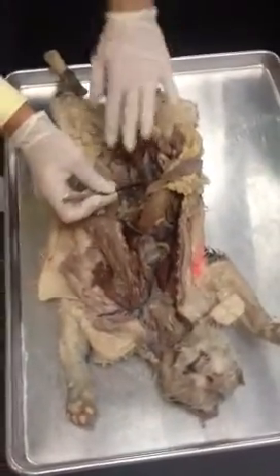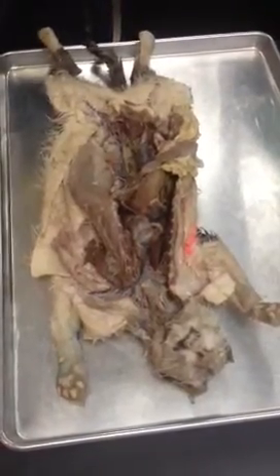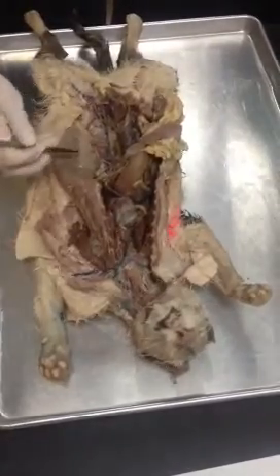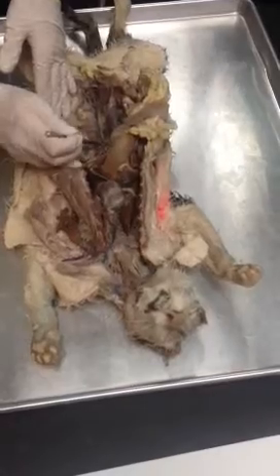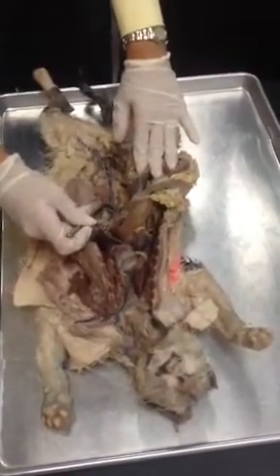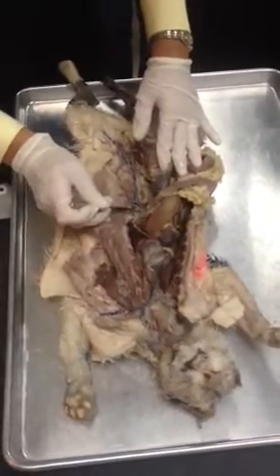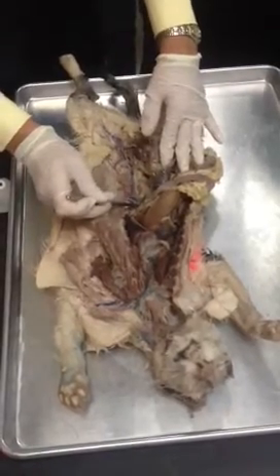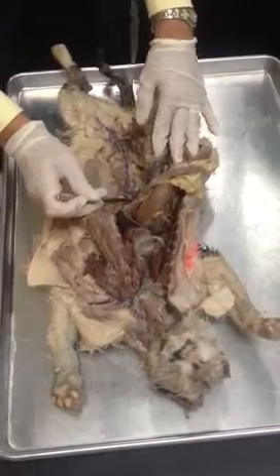On the right side it should be that all of these three flow directly, individually and directly into the inferior vena cava. On this cat it is not so obvious. Right? It is not so obvious, but just remember that this will be the renal vein. Renal vein. This looks like a suprarenal, and you see that it goes directly into the vena cava, which should not be.